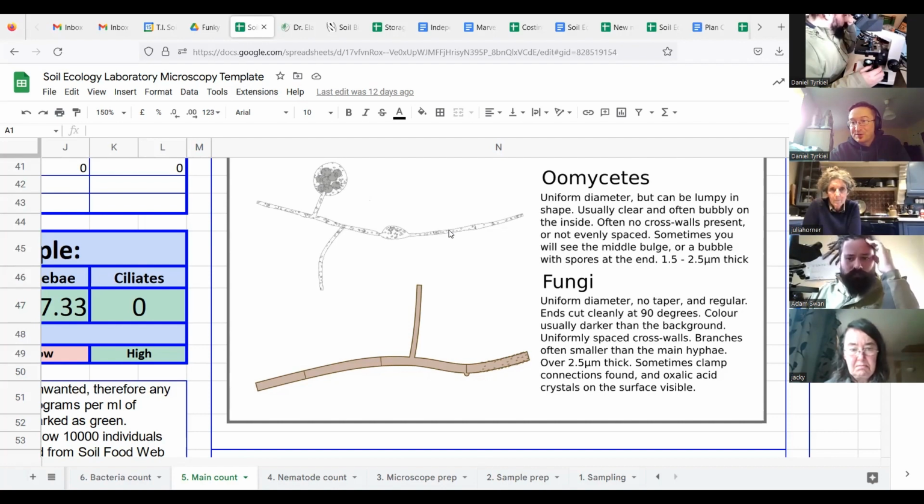You can look at oyster mushroom, any other gourmet mushroom under the microscope. Freshly growing hyphae will look like this. It's going to be frothy on the inside, it's going to be clear, and it's going to have thin walls. And so it doesn't tell us that it's not a beneficial fungi. It's only this period of its development that basically means that it's freshly growing hyphae. So that's something that we like to keep in mind.